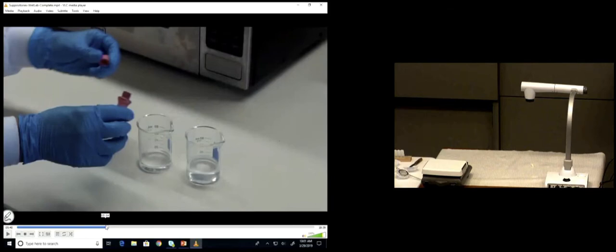At the stations, I only have blue food coloring, and I have a drop of blue food coloring. I want you to put 1 drop of blue food coloring into which beaker, though? The small one. The blue color is supposed to represent the drug, all right? Because that's the beaker the drug's going to be in, and it will help you visualize your rinsing and your attempt to get all of the drug out of the beaker and into the mold. That's the only reason we're doing it.